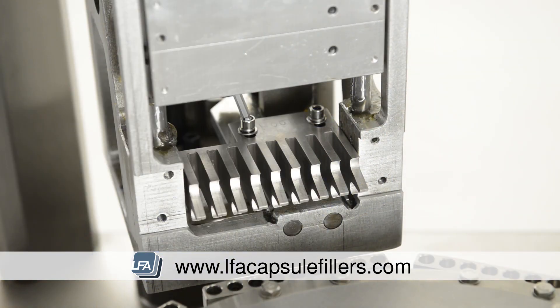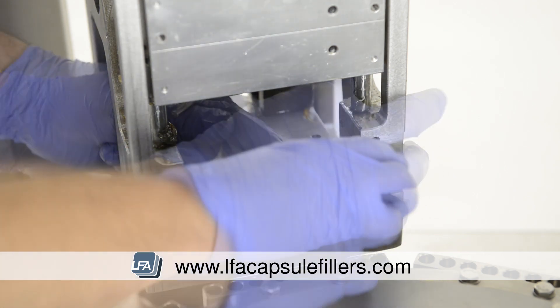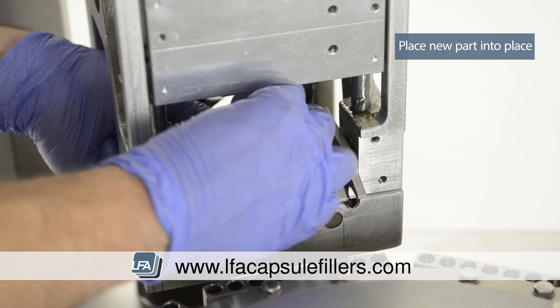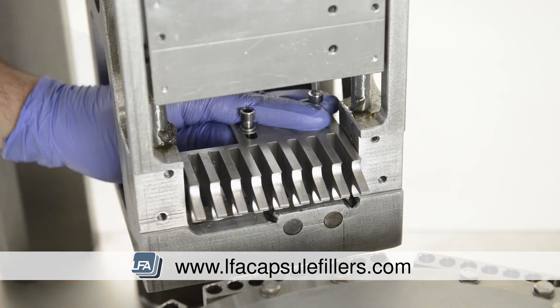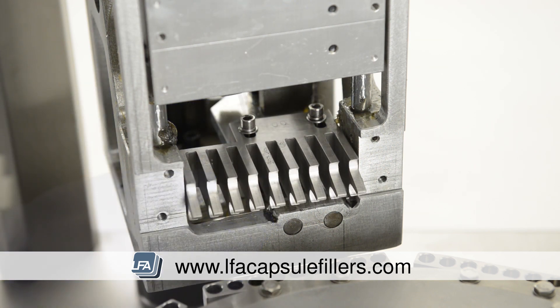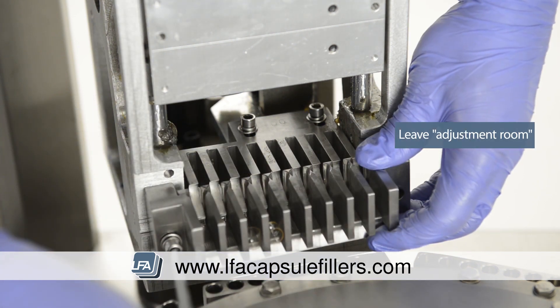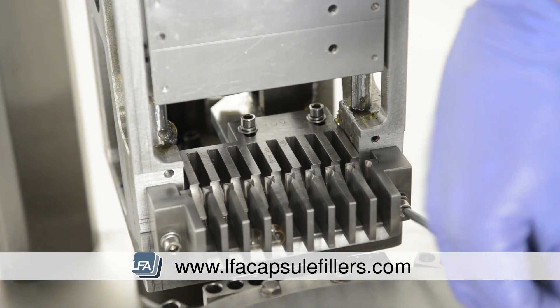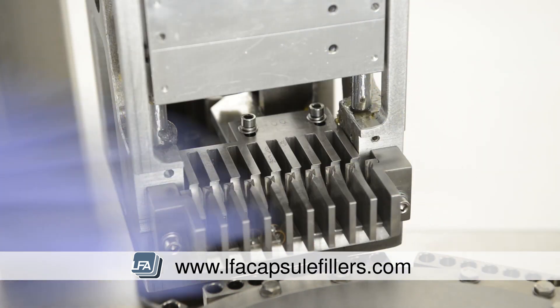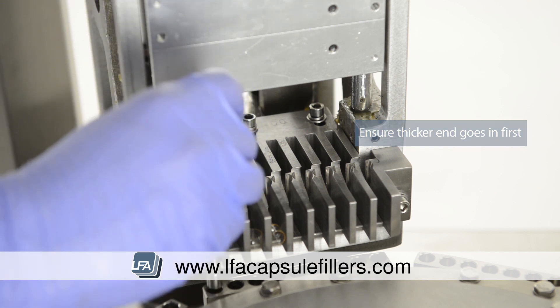Now we can remove the two bolts which will release the back teeth and allow you to remove them. Place your new back teeth into place, replace the bolts and tighten, but leave them loose so we're able to adjust them. Slot the front teeth back in and replace the two front bolts — again don't tighten all the way so we're able to tune them. Next, slot your calibration tools into the end slots ensuring the thicker end is slotted into the holes, and make sure there's very little play.